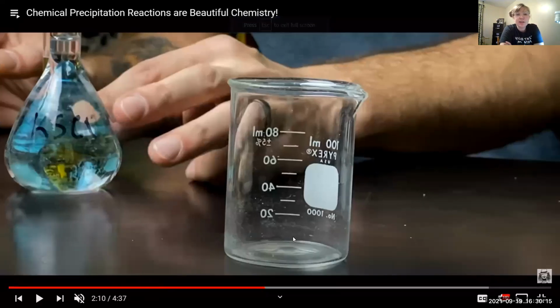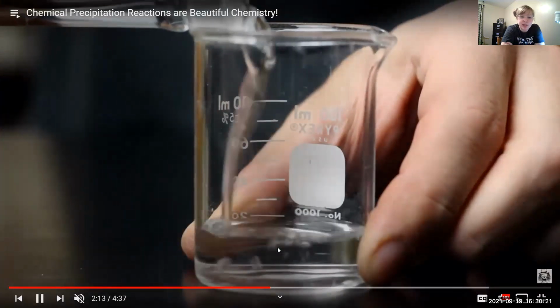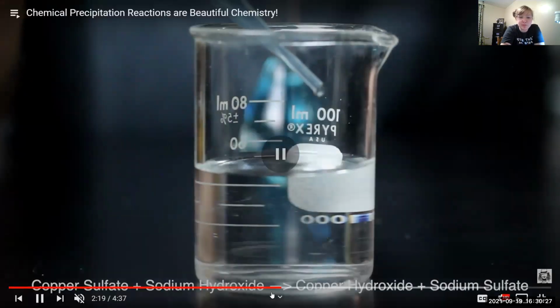No sound. So this is another video that's showing a precipitation reaction. Here's what's happening. We have copper sulfate plus sodium hydroxide making copper hydroxide and sodium sulfate.